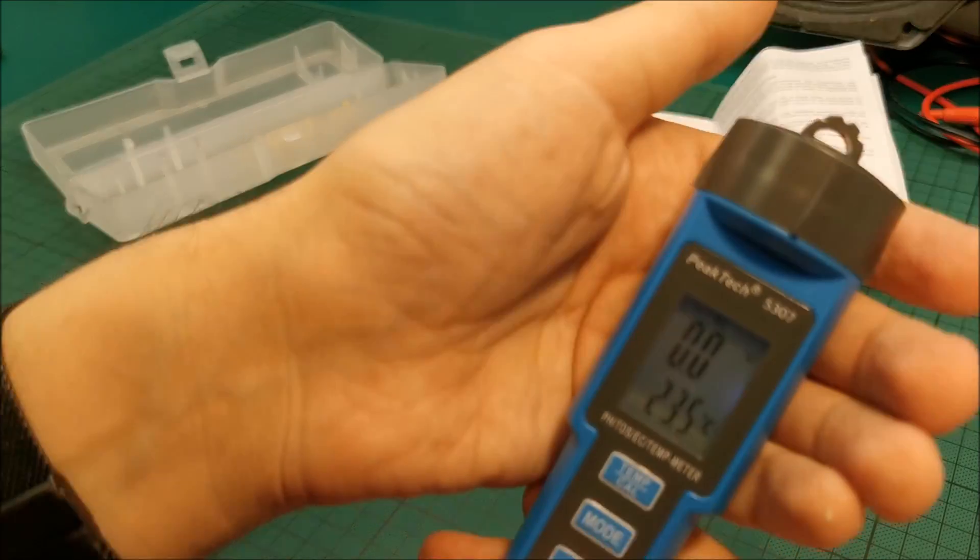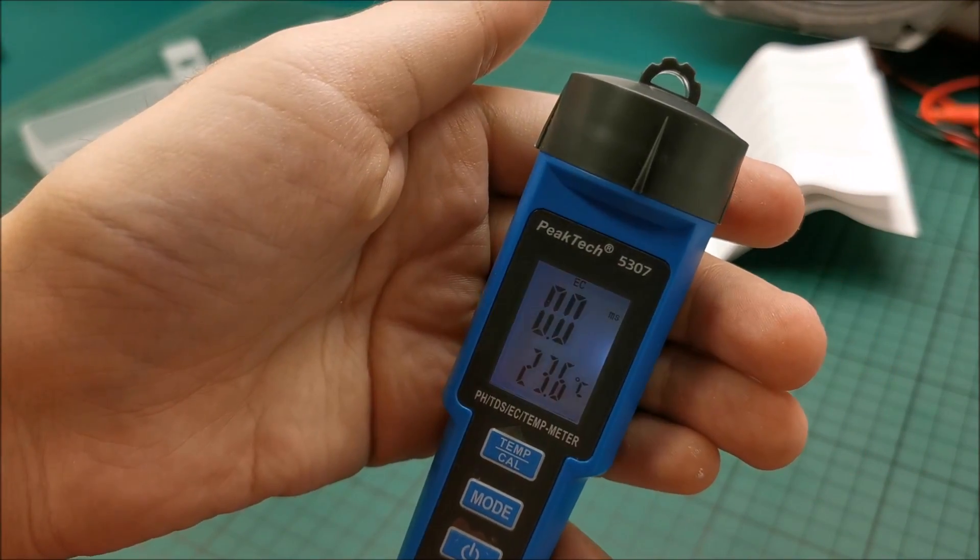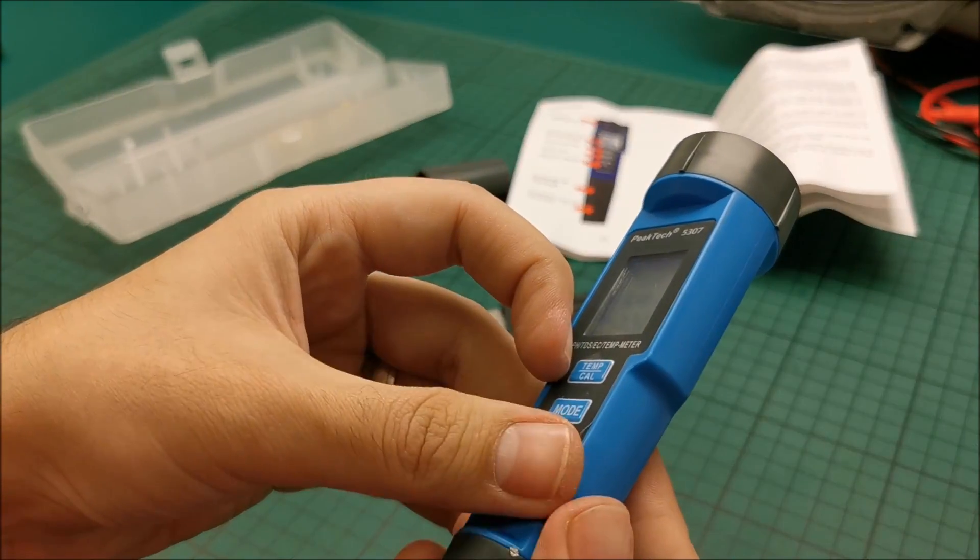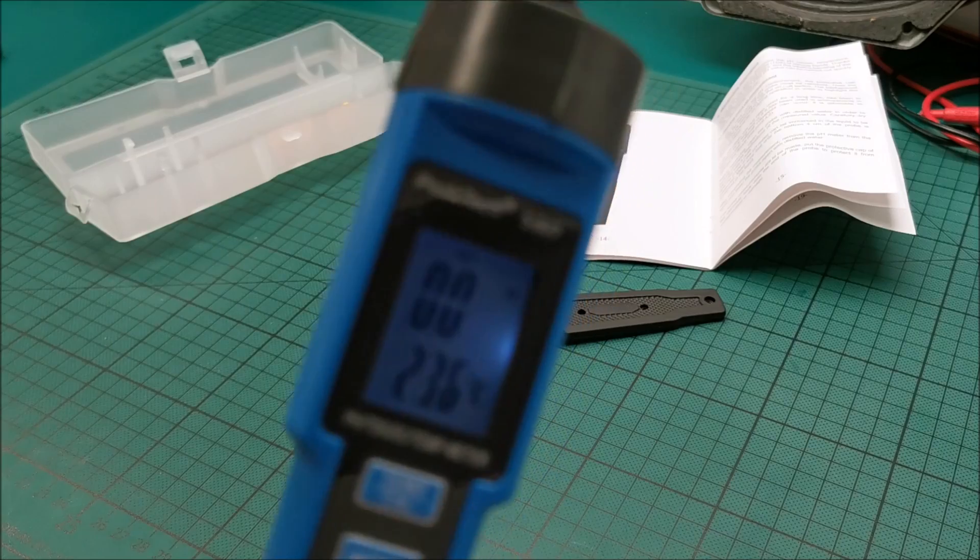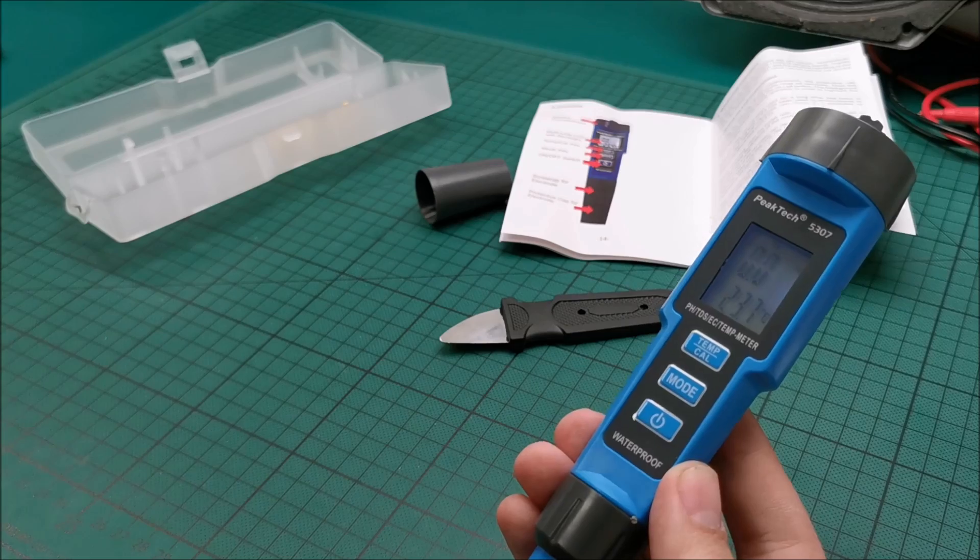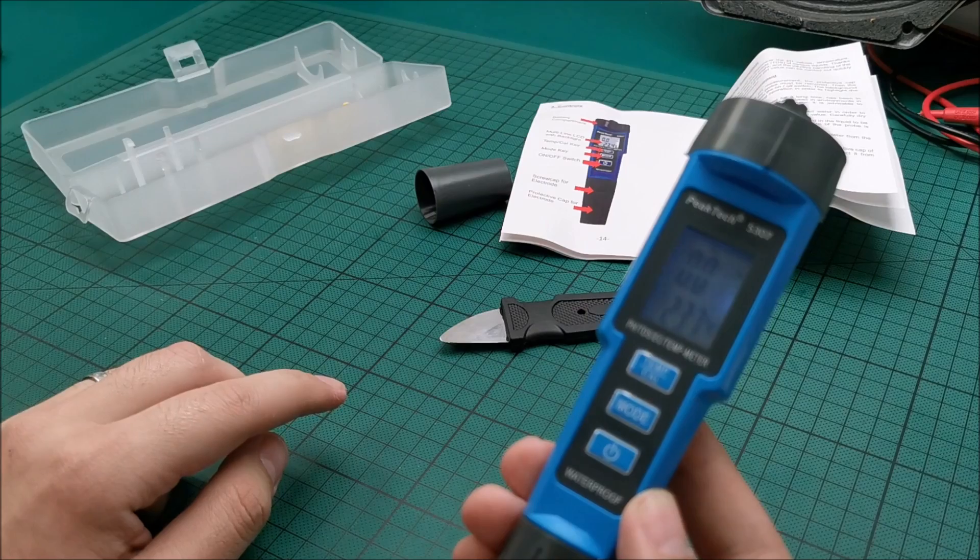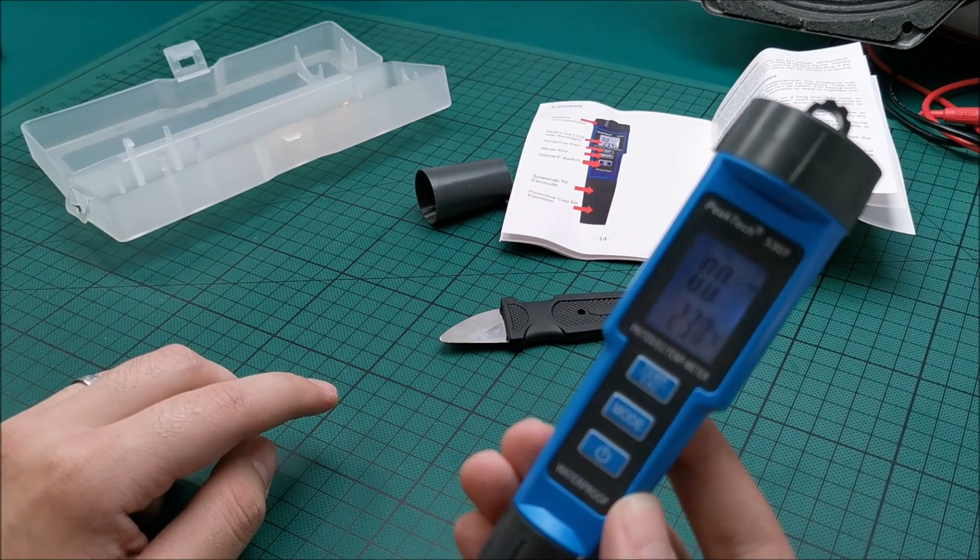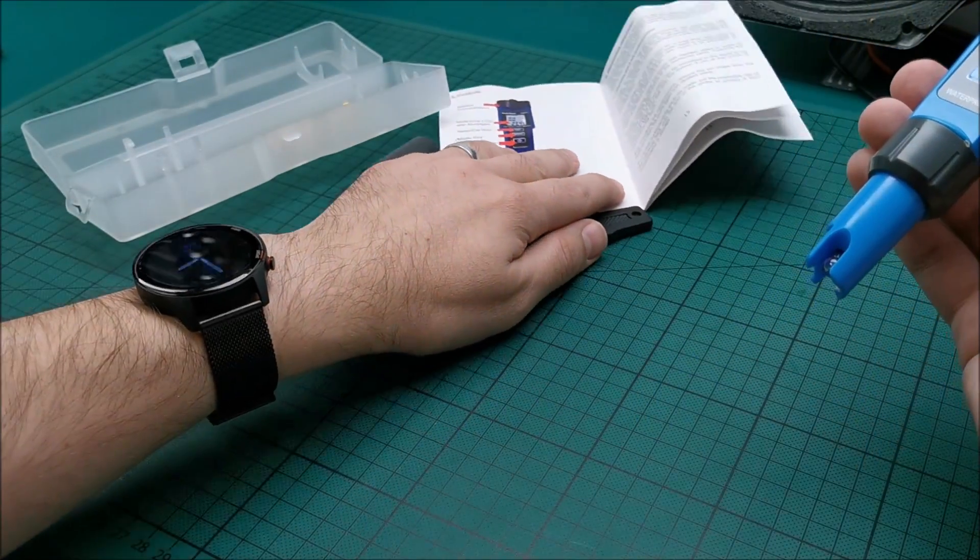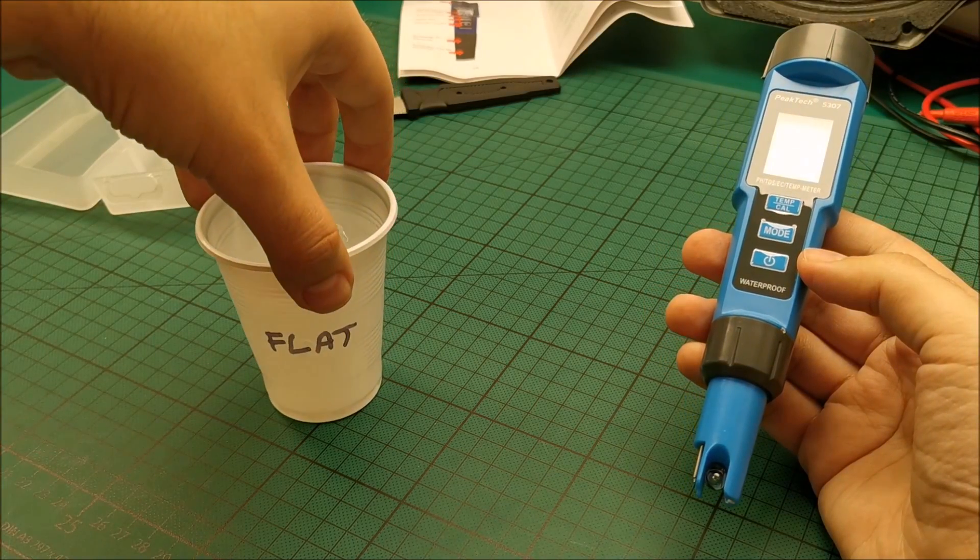Let's see. And for as long as it's on, turn off this light, not need it anymore. We have a backlight. Remove this so hopefully it will be a bit more clear on camera. And it's good. So now at this point, temperature 23.7. Yes, considering that it's in my hand. Yeah, makes sense, because in this room they are about 23 and you can see it climbing. That's about where it needs to be. And now let's start with some tests.